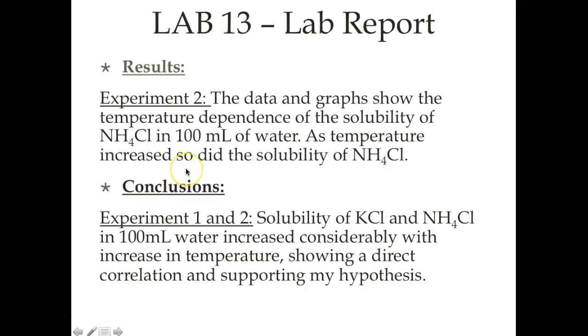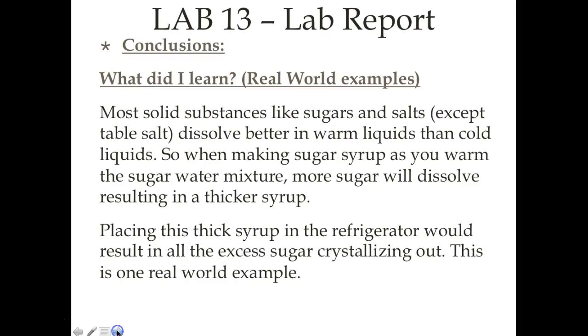So the temperature dependence of ammonium chloride in 100 ml of water is identical to KCl in the sense that as temperature increased, so did the solubility of ammonium chloride. Okay. So what are some of the conclusions that you can draw between the experiments 1 and 2? Well, the solubility of both increased as the temperature increased in 100 ml of water. All right. And that shows there's a direct relationship between solubility and temperature, which did support my hypothesis.